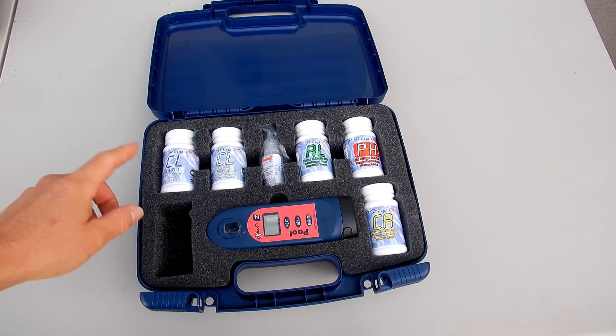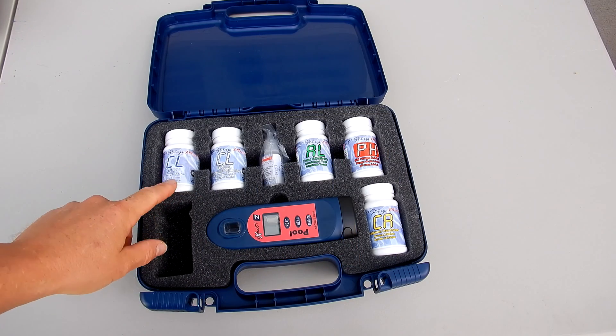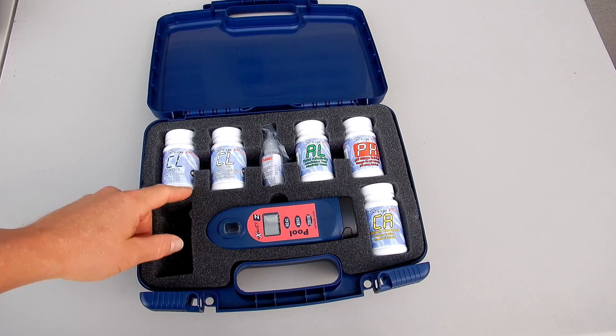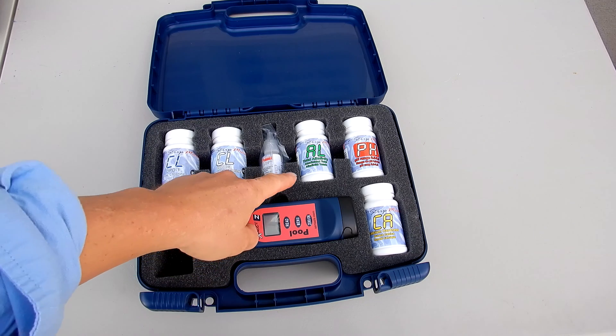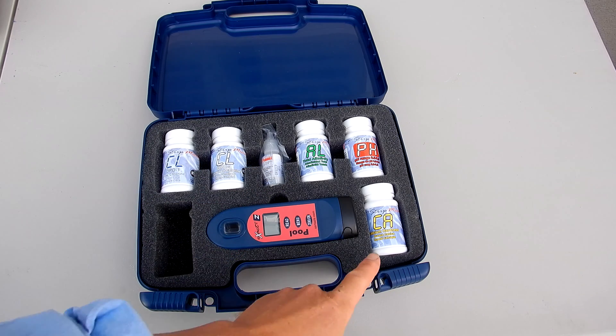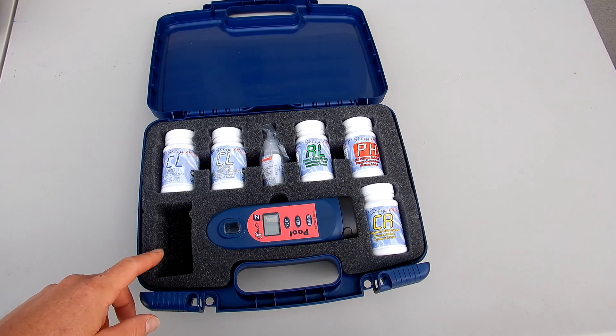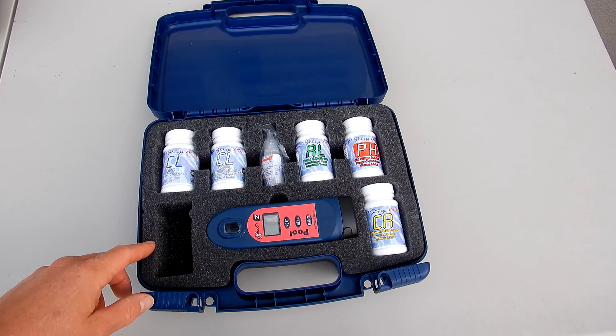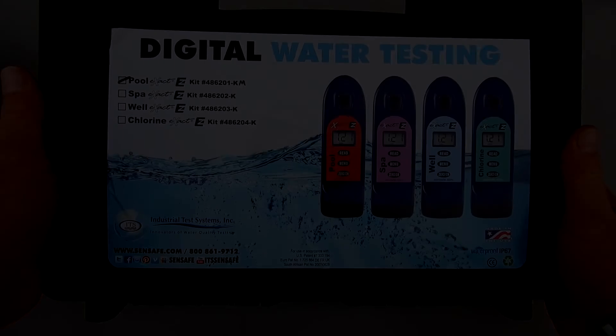Included with this kit is the exact strip micro for free chlorine, combined chlorine — which gives you your total chlorine — the cyanuric acid reagent, alkalinity, pH, and calcium hardness. There's also a slot available if you wanted to add another test factor like copper, phosphate, or salt.